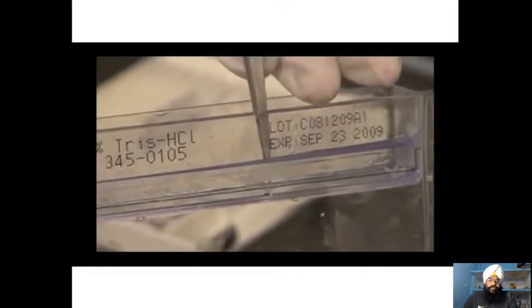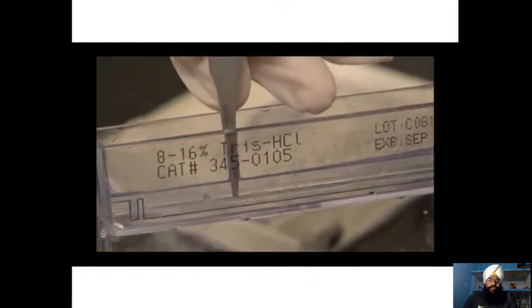Working quickly, use your forceps to push the IPG strip against the gel to push out any air bubbles. Agarose is going to solidify fairly fast. You can see the agarose filling in the place of the bubbles as they get pushed to the top. Small air bubbles are not an issue. Try to get some of your larger ones, and you should not have any problems for your second dimension gel.